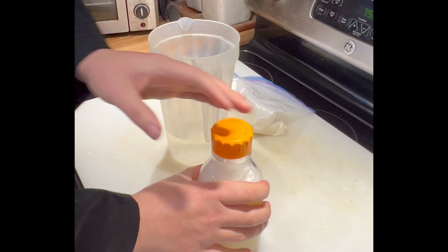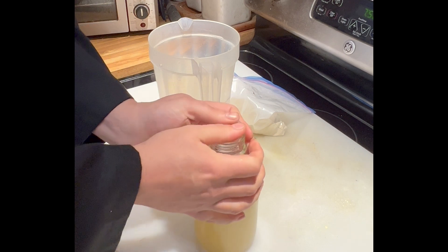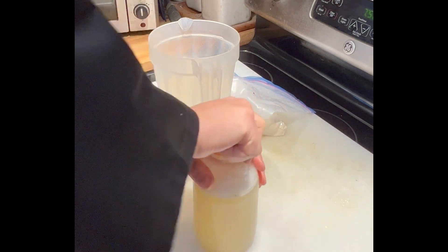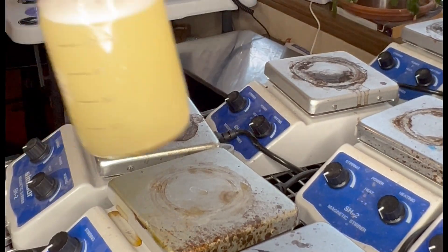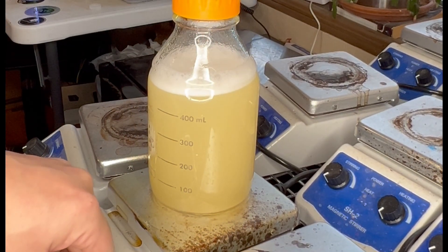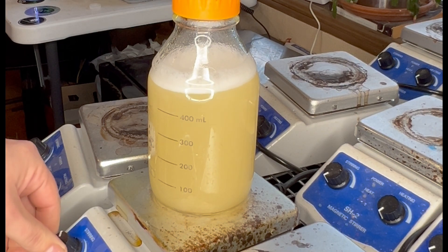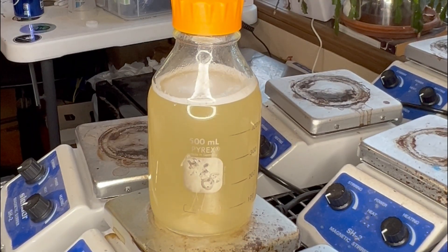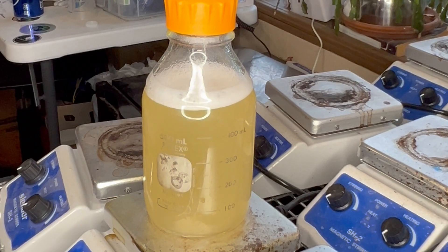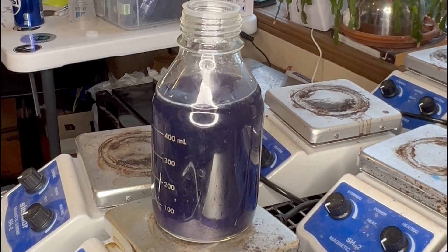Now we're going to add our magnet and our pouring ring top so we can show you our first method — the stir plate method. We'll speed this up for you because this one takes a little while, about as long as the stovetop method. You'll notice over time it starts to get clearer as we're heating it up and the agar melts in. Once it gets to this clear stage you're about ready to add some color if you want to.